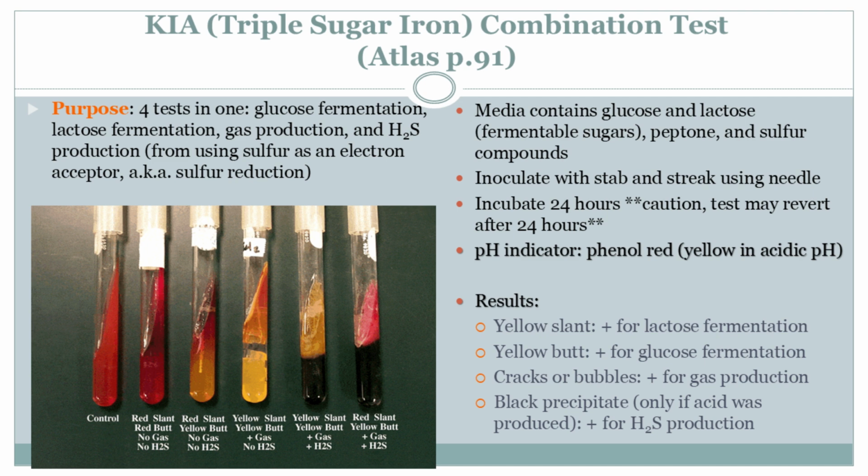That's so cool. What about a bacteria that gives us a totally different result, though? Let's see, how about Pseudomonas aeruginosa? Pseudomonas. I feel like I've heard of that one. It's a bit of an opportunist, this one, often found in things like soil and water. And it causes infections, especially in hospital settings. Right. Now, Pseudomonas doesn't ferment glucose or lactose. So on the test, you're likely to see a red or orange tube. It's getting its energy from that peptone we talked about, not from the sugars.